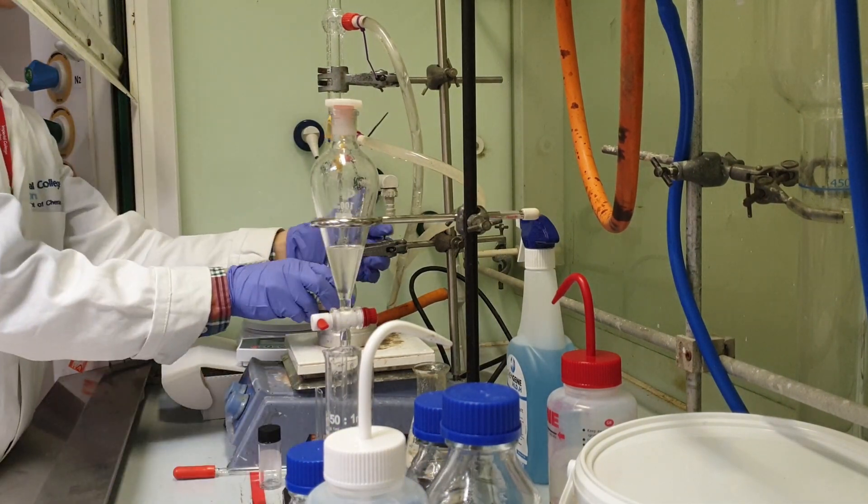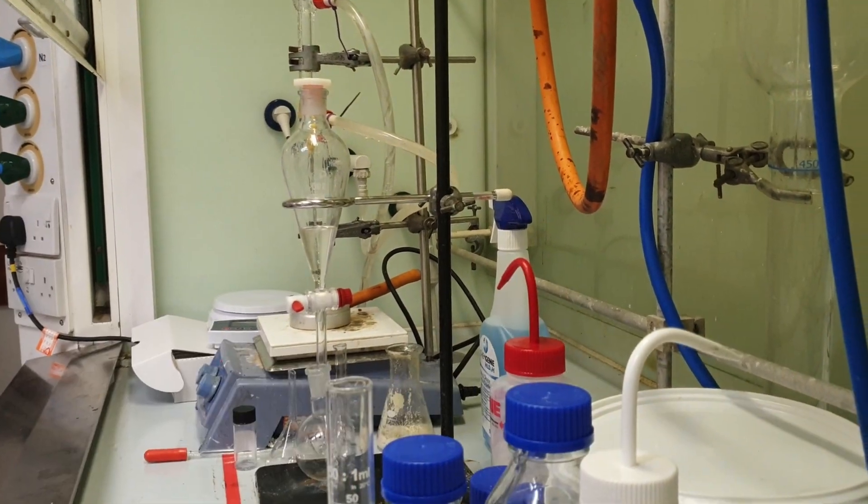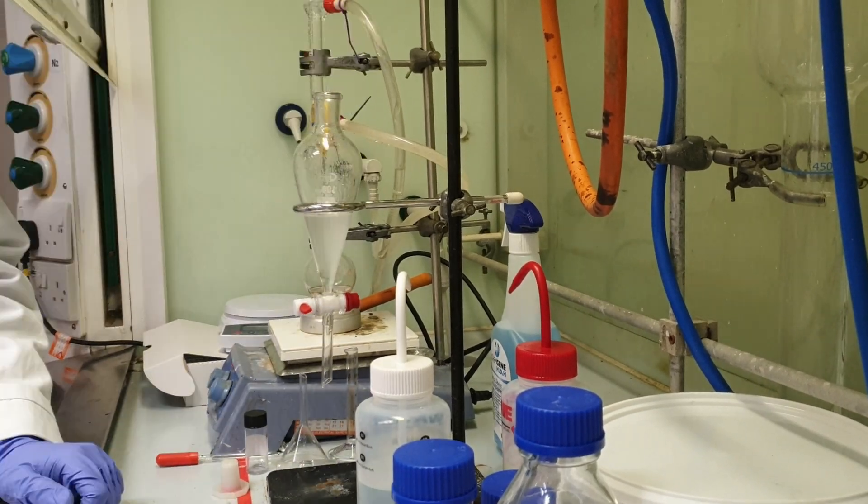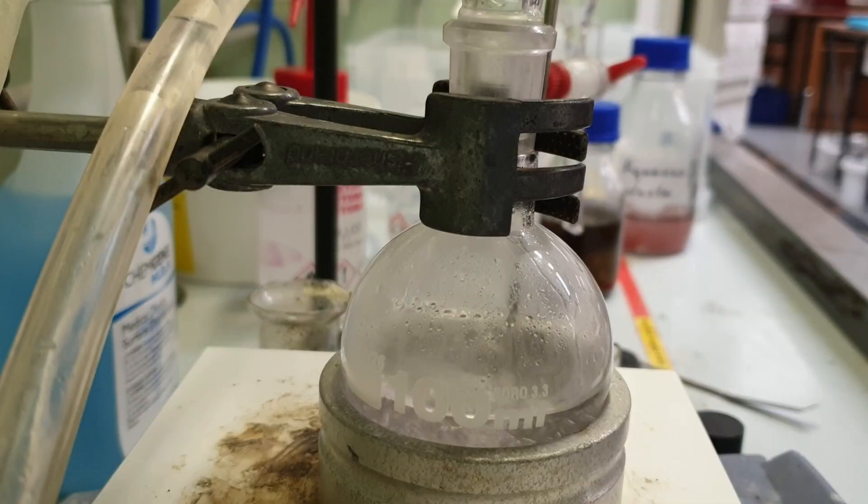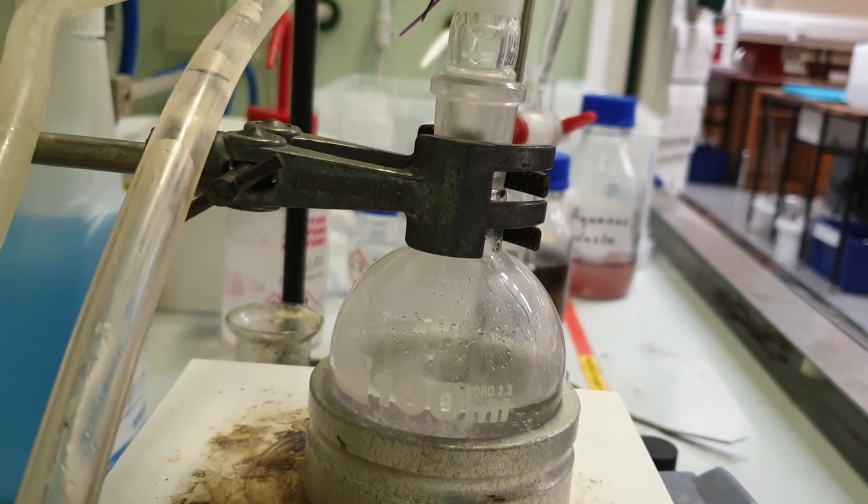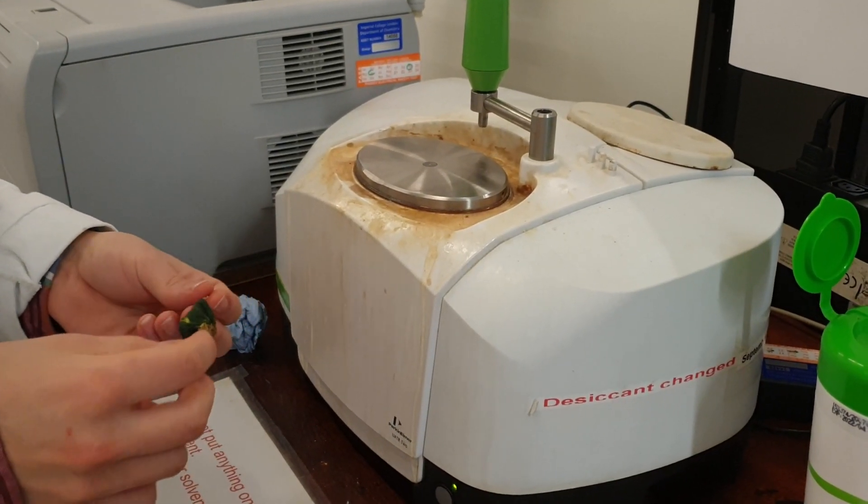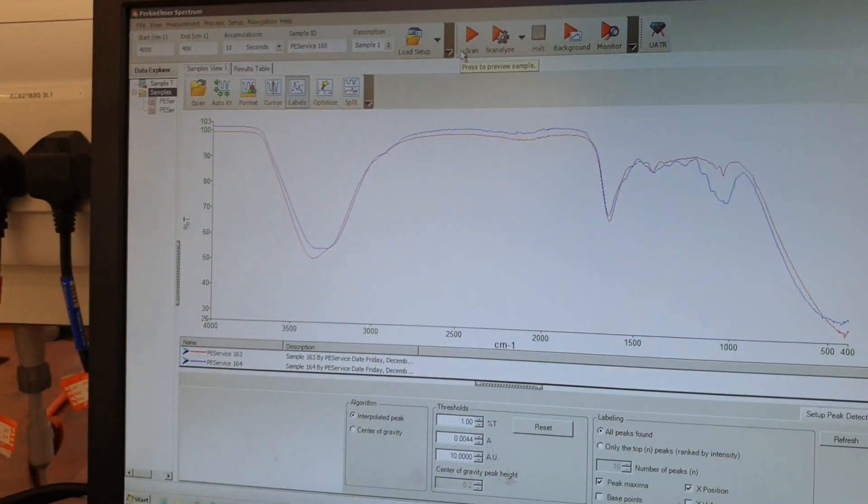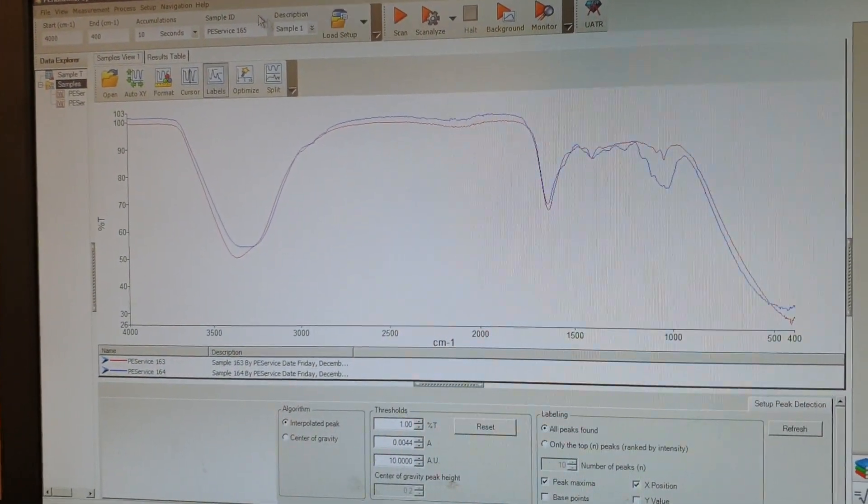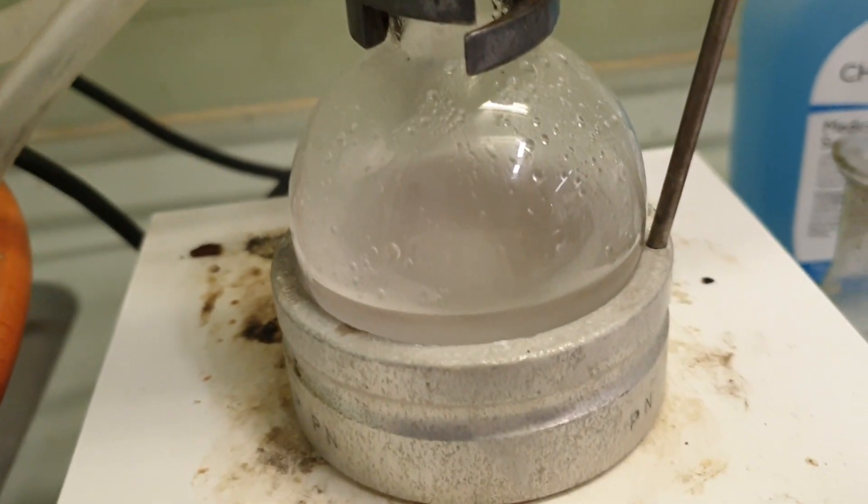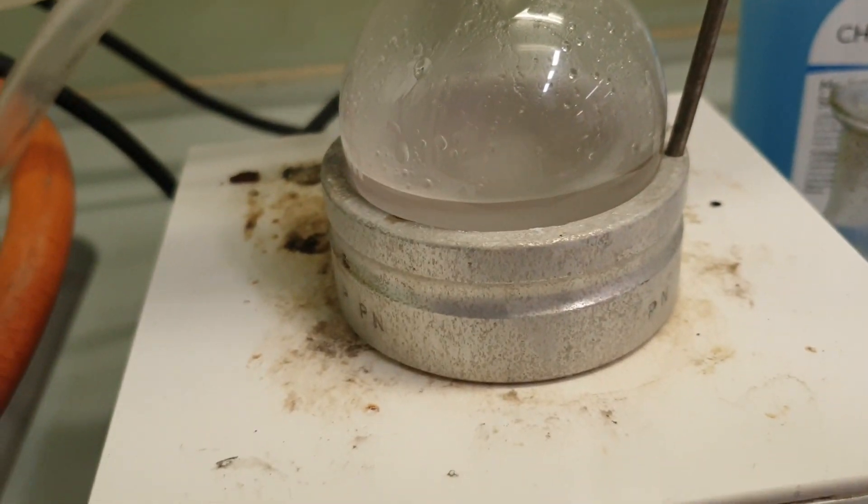Having finally realized what I was doing wrong I decided to make a third attempt. Let's see how it goes. We're doing spectroscopy on courgette here. I've got some courgette that's kind of dried out. We've done some important science here. And refluxing this time it didn't go dark. So success.